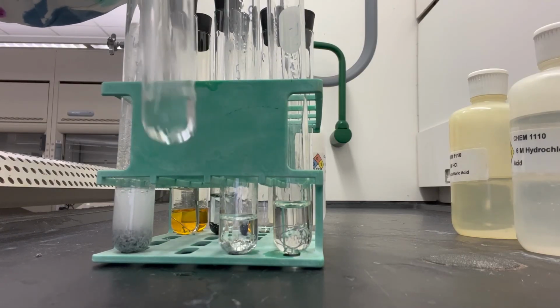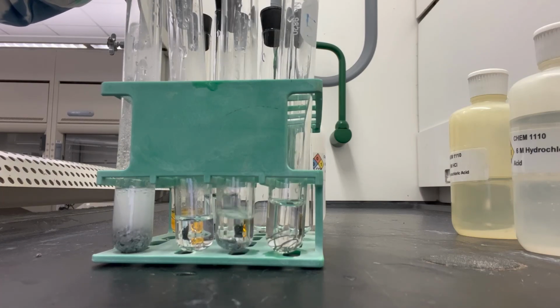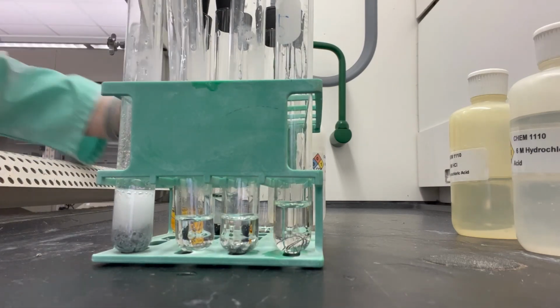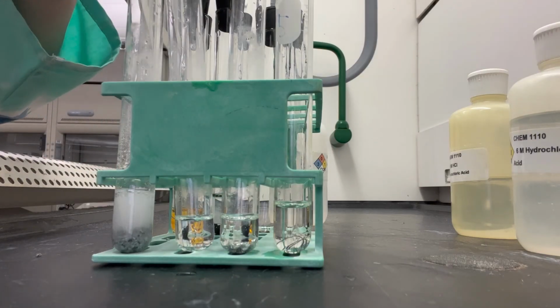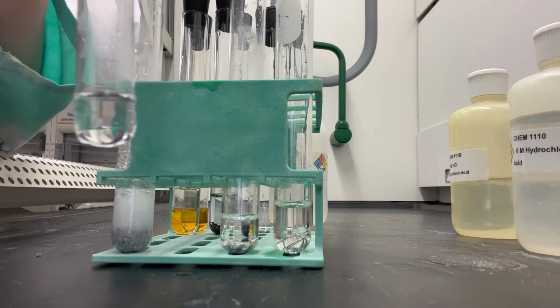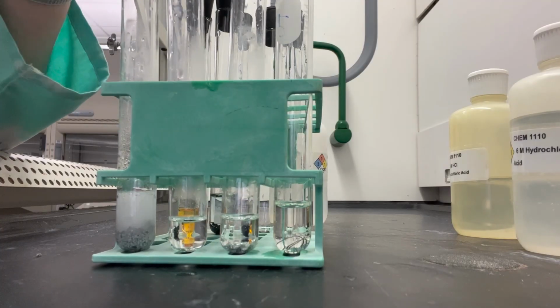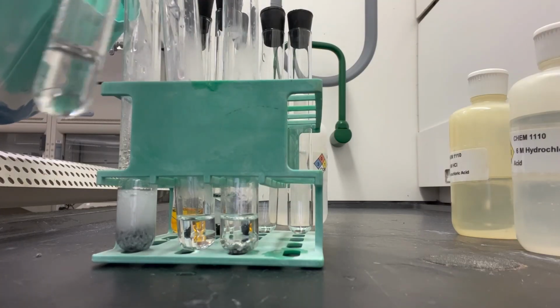It's not even in the thing anymore. And the iron and the tin didn't really do much, but the zinc is definitely reacting. So again, magnesium completely gone, completely reacted. Zinc still reacting. Tin, nothing. And iron, nothing.